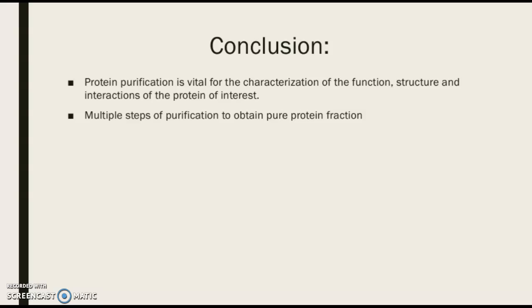This also just shows that purification of proteins isn't just one type of chromatography or just dialysis. It's multiple steps of purification to obtain a pure sample of your protein. In our case, at any point, we can rerun our fractions through any of these columns if we see our protein isn't pure by just checking the SDS page now and then. But overall, this project is just to show that protein purification is a multi-step process and can be done right here at Keene State College.